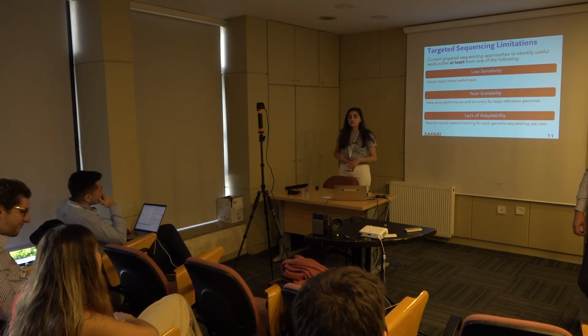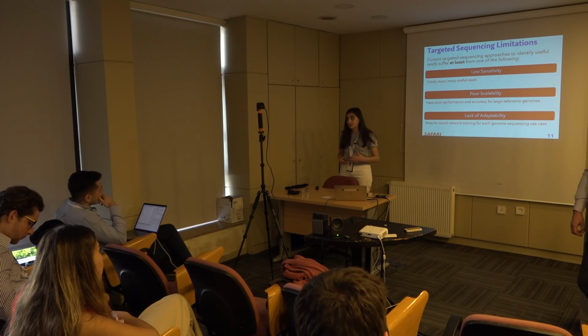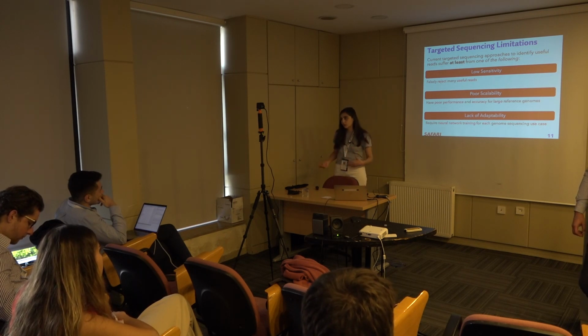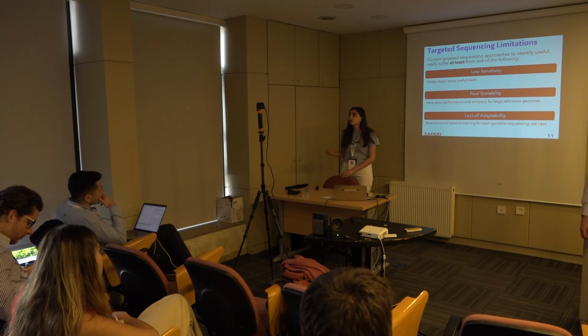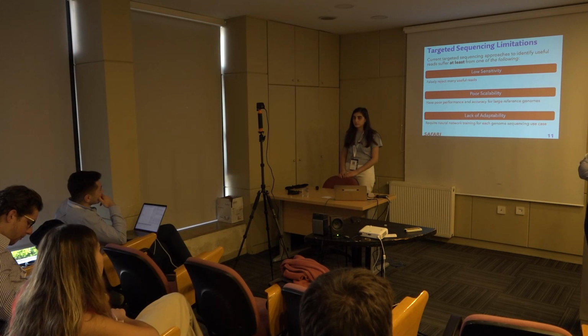You can try it as is as well, but it will have the limitations of prior tools as well. I don't think we would be able to achieve very high sensitivity in keeping useful reads, as high as we achieve now for the pre-basecalling filtering problem. But as I said, we could optimize the module for this particular problem. Okay, sounds good. Thank you.